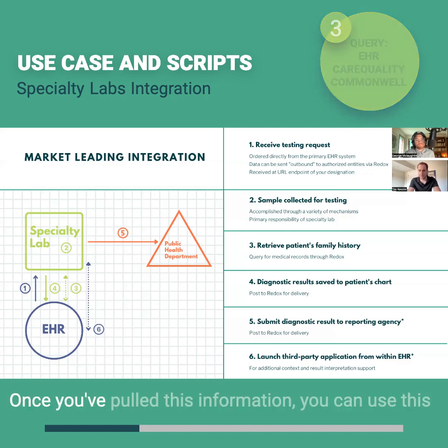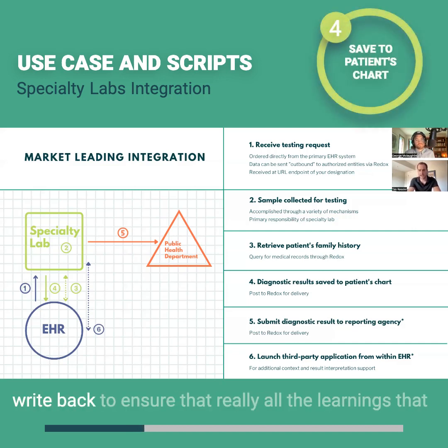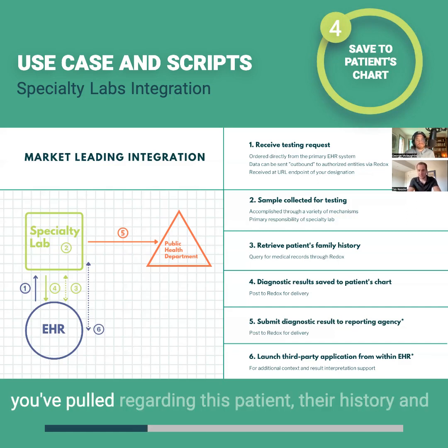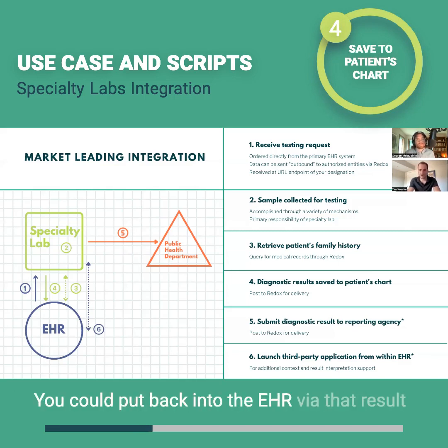Once you've pulled this information, you can use it to enhance the results that you're ultimately going to write back, to ensure that all the learnings you've pulled regarding this patient, their history, and how best to continue treating them moving forward, you could put back into the EHR via that result payload that we're writing back inbound, and have that appear directly at the provider's fingertips.